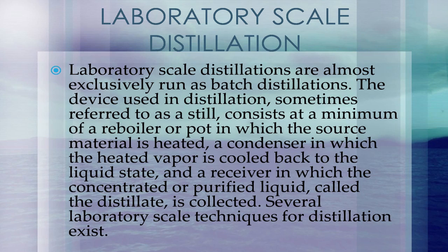If the substances involved are air or moisture sensitive, the connection to the atmosphere can be made through one or more drying tubes packed with a material that scavenges the undesired air components, or through a bubbler that provides a movable liquid barrier. Finally, the entry of undesired air components can be prevented by pumping a low but steady flow of suitable inert gas, like nitrogen, into the apparatus.